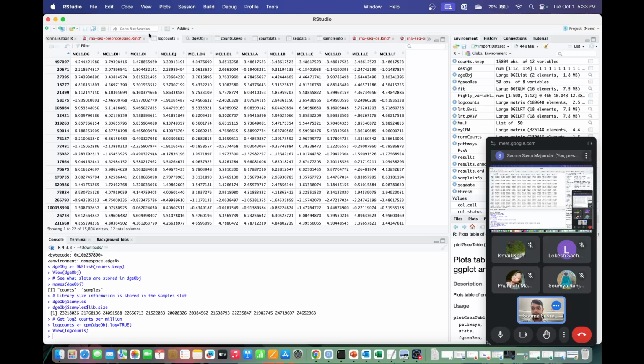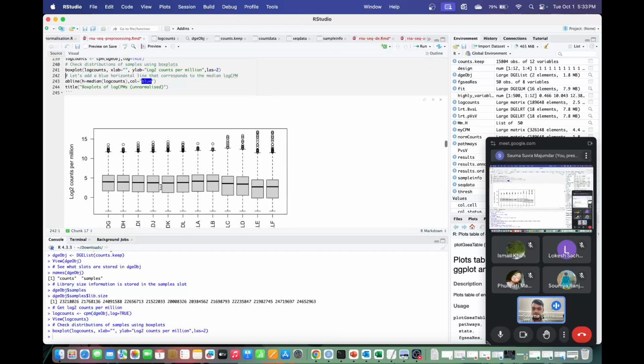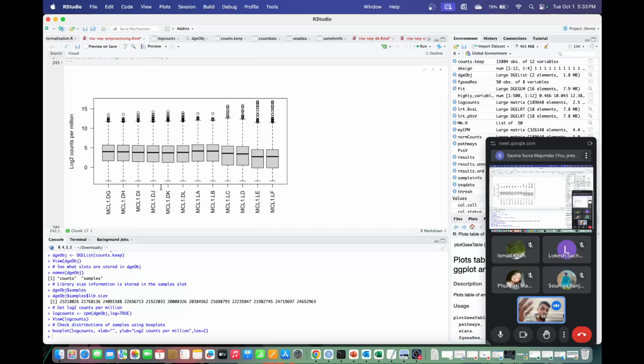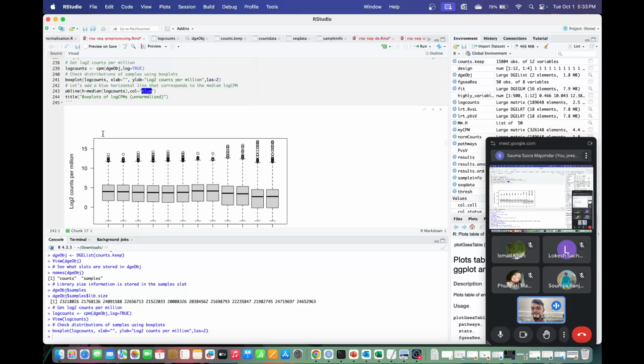Now this will be normally distributed. If you want to see the box plot, it's actually pretty good. The log value has scaled the number of counts that is there, and basically all of them are around a similar amount. So the scaling is not an issue here. Along all the samples, we have a similar kind of scaling for the counts matrix.